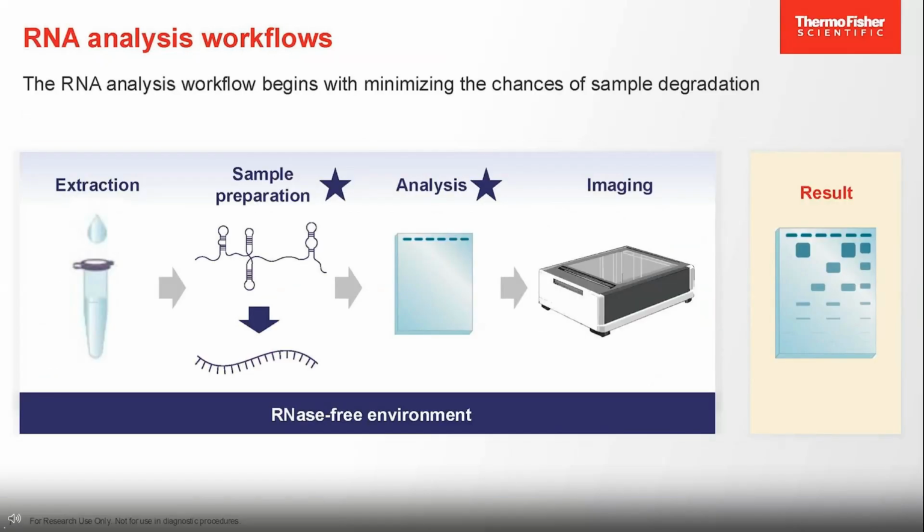The whole RNA electrophoresis workflow within the context of your experiment should be performed under RNase-free conditions as much as possible. What that means is that from extraction all the way to imaging, you have to minimize the exposure of your sample to any RNases that are present in the environment. We will not be covering the extraction part of sample preparation within this webinar, but we will be going into the sample preparation prior to loading it on the gel, and then we will go through the documentation systems as well.